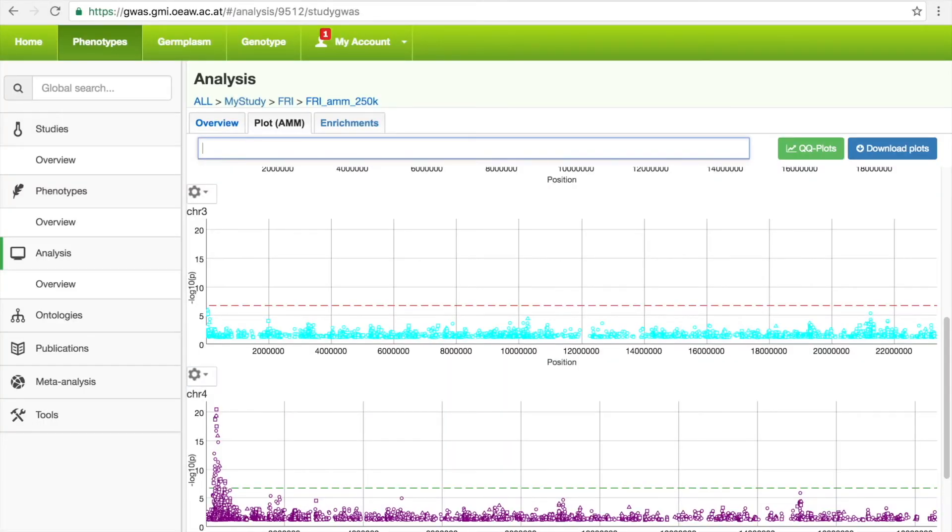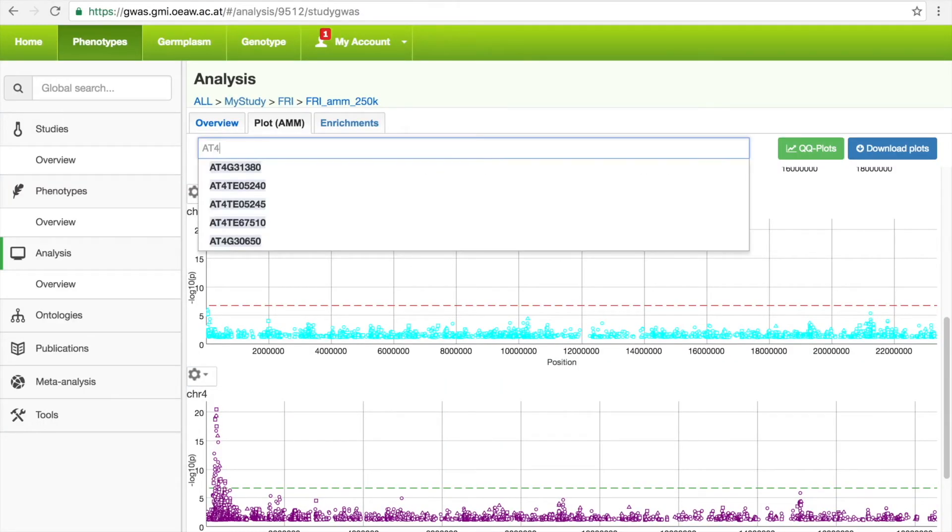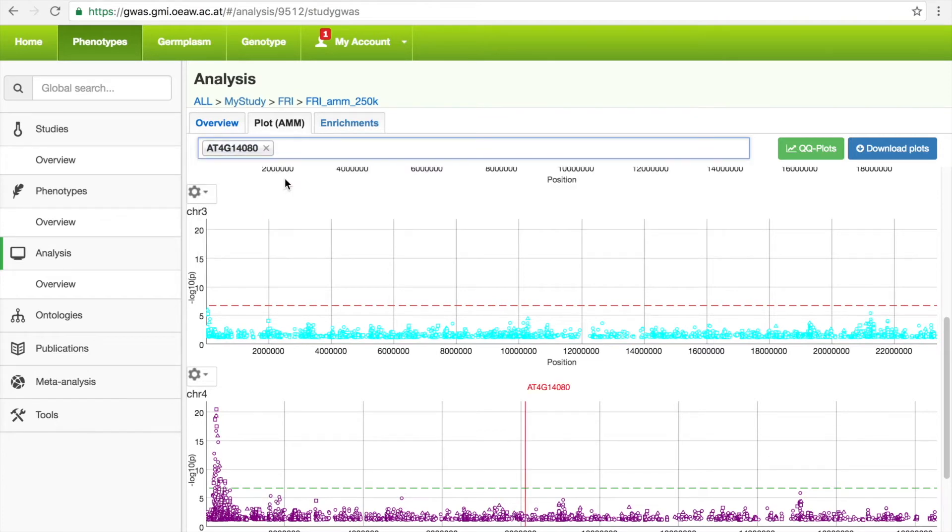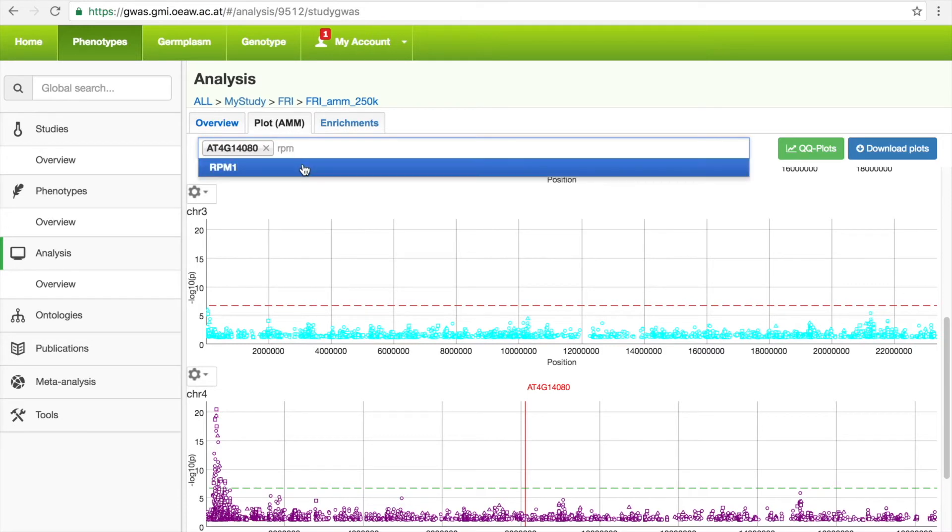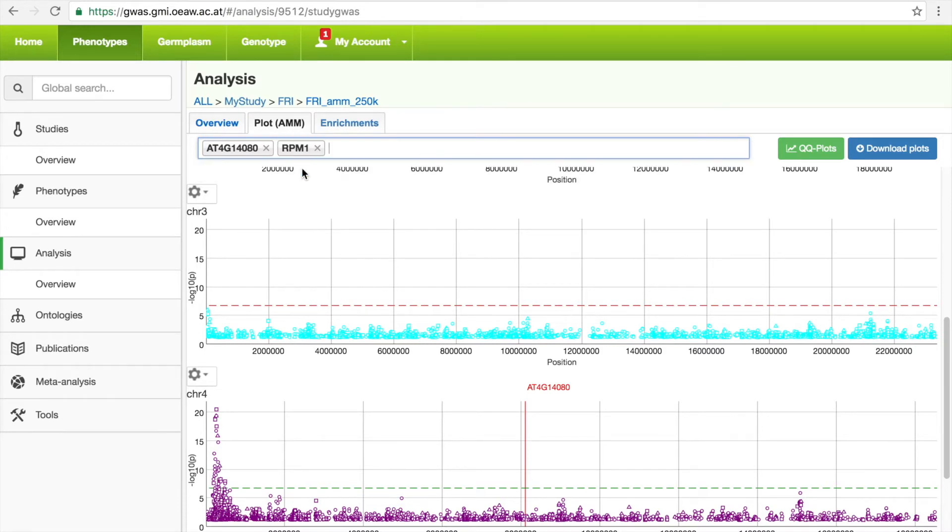As another useful feature, the user can search for any gene using the gene ID, and the gene's location will then be displayed with a vertical red line. Alternatively, candidate gene lists can be searched, and, here for RPM1, the location of defense-related genes are displayed.